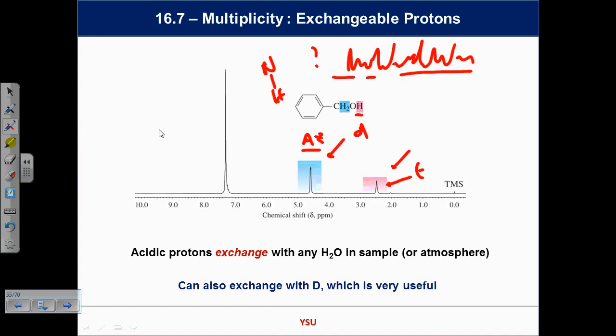I can add D2O, and we've seen a little bit of this stuff so far. It's a good solvent for organic samples because it's not going to be seen in the NMR spectrum. It's magnetically inactive, and so you can use it as a solvent to dissolve things up, and it won't swamp out your spectrum. But imagine now if you put this sample into some of this, and this is the solvent. You would exchange this for this. You would end up with a molecule which had D there instead of H. And because you've got a large excess of the D2O, all the molecules will have D there. Now that tells you which proton we're dealing with in the spectrum. Because guess what? Where this H will show up, if you put a D there, the signal disappears.